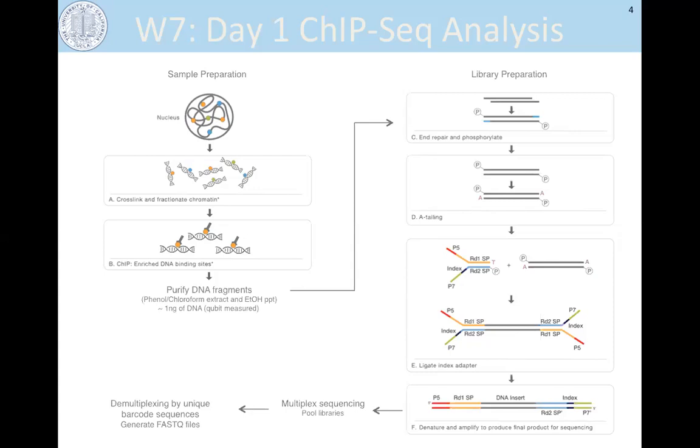So that's to capture protein-DNA interactions and also to prevent the loss of these interactions upon fragmentation of chromatin. So typically you fragment chromatin with sonication, and you want to get DNA fragments to a size around hundreds of base pairs. And that way you can immunoprecipitate using an antibody that is specific to the protein or the factor, the histone modification that you want to study.